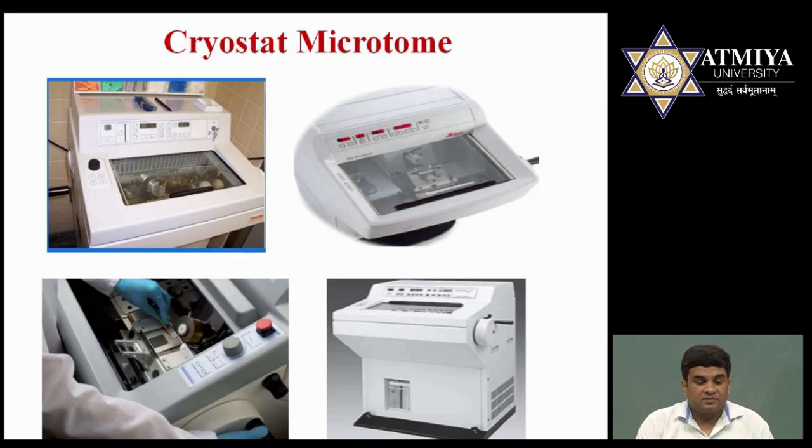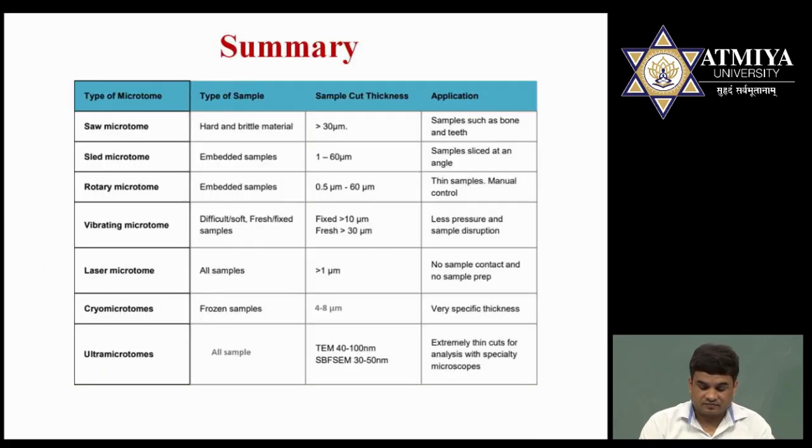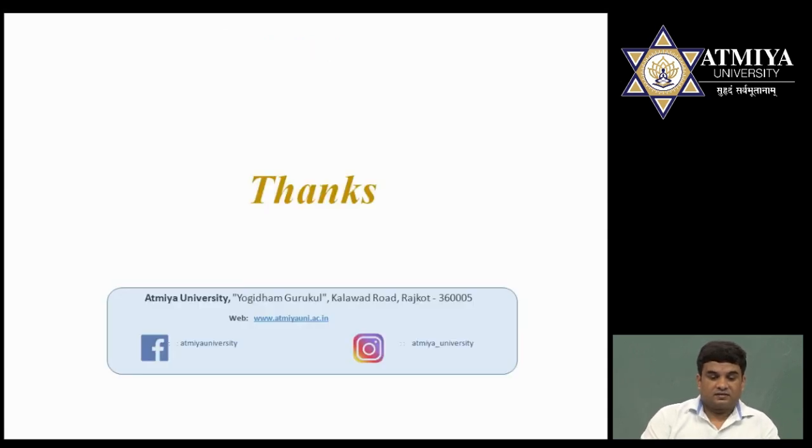So these are images of various examples of cryostat microtomes, where the refrigerated cabinets are there, and they are used to cut frozen samples. Here I summarize all the types of microtome for a quick review. Hope you understand the functioning of the microtome.